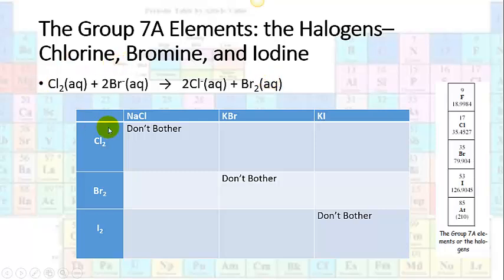All of these different reactions that are taking place, you will have all of your observations in your report form, and you're also going to have to write the chemical equation for what happened. You can do that at home, but make sure you take your time writing the equations. You will be graded on the accuracy of those, as well as how complete and accurate your answers are at the end of this report form. So take your time with those and have fun with this. This is a pretty fun lab.